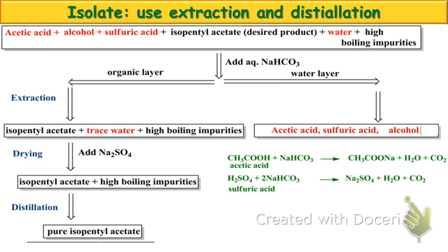After the reflux, we've reacted it long enough, we need to go through and isolate your product. Okay? You've got a bunch of different things in there that contaminate your product. You've got unreacted starting material, you've got sulfuric acid, you've got your product, you've got water, and then you've got whatever else could possibly occur during the reaction. Okay? And you sometimes get a lot of that junk going on. We need to come up with some way to separate all of those. The first thing that we're going to do is add bicarbonate. Okay? Aqueous bicarbonate. What is bicarbonate?